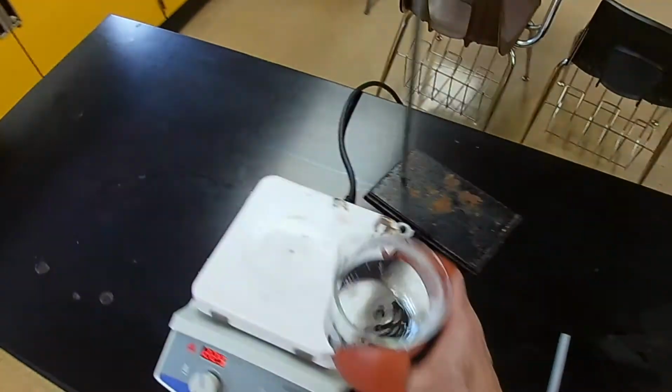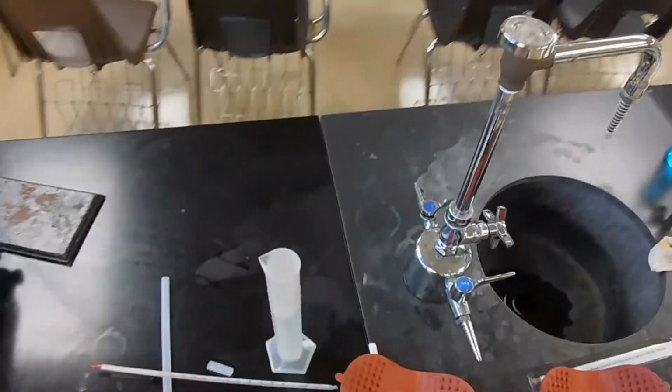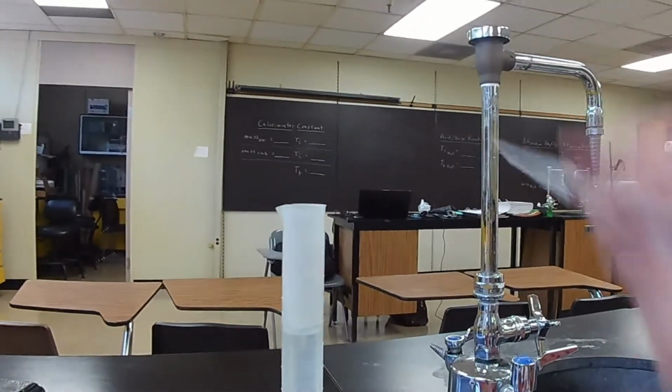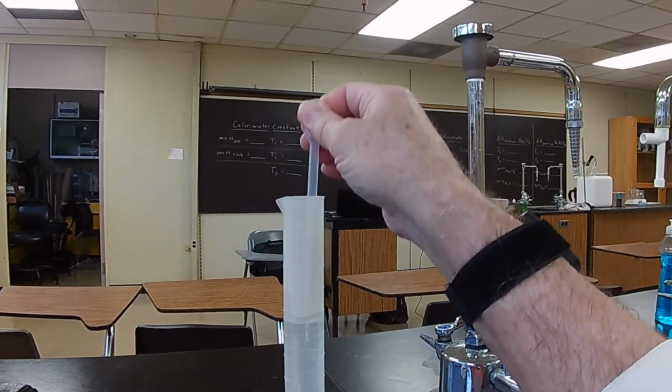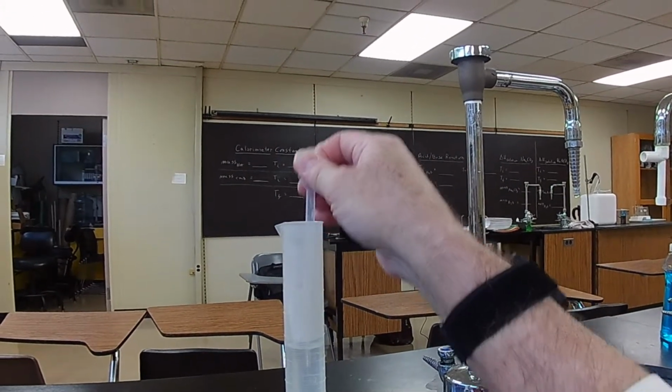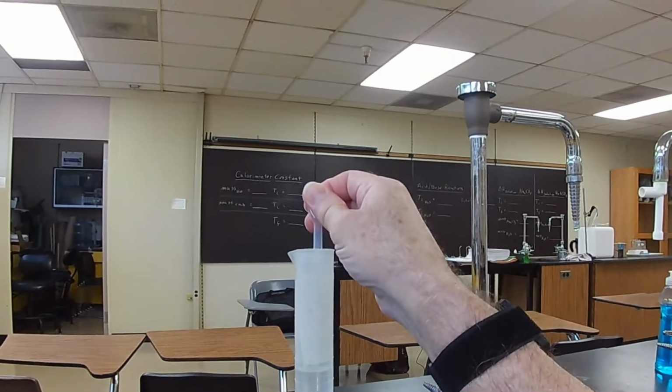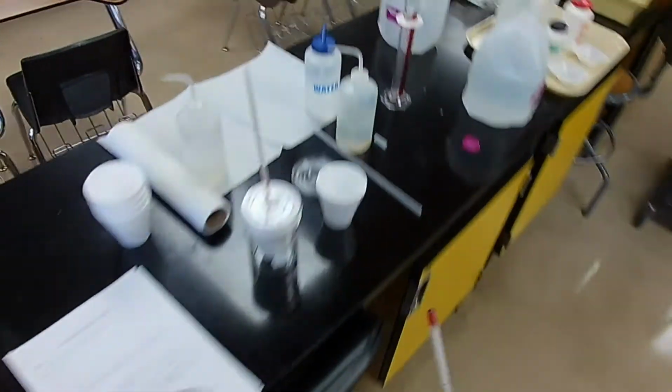Now, I bet I went over. So let's see. Oh, it's very, very close. We'll just take a little bit out. Just a touch. There. Exactly, 75. Now we're going to put this in the styrofoam cup.